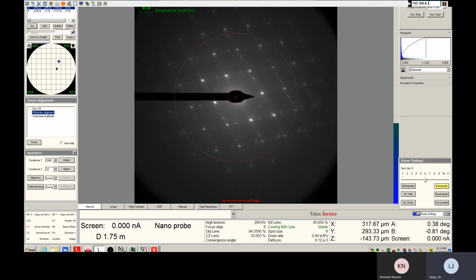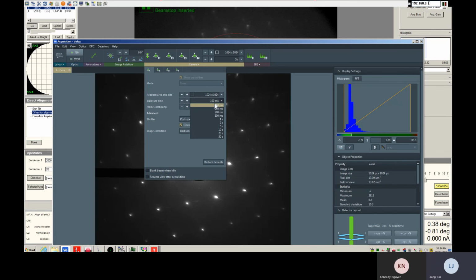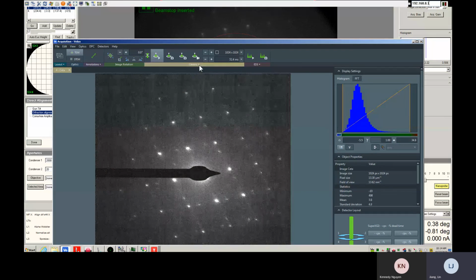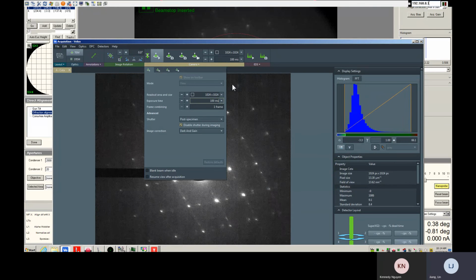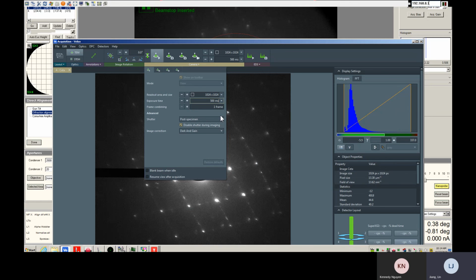And next screen, go for acquisition, go for view first. 50 view first. Yeah, minimal count to 100. You can go 200. I think they can go 500. Yeah, so 500. You can go 10 frame.